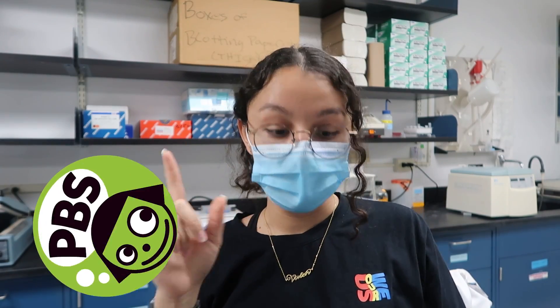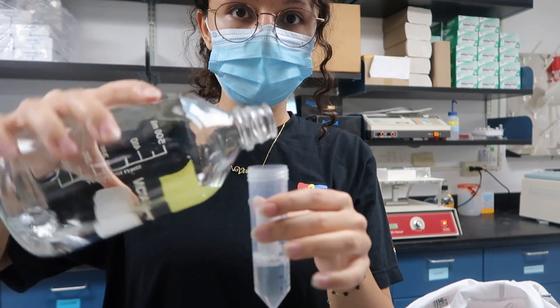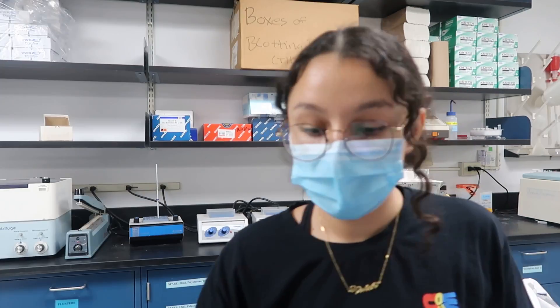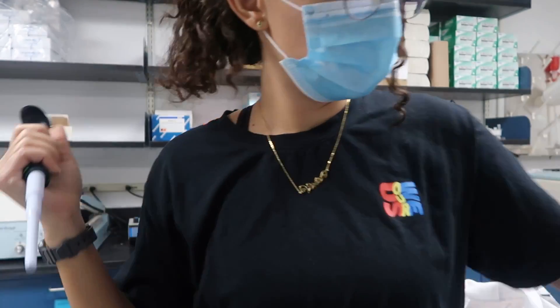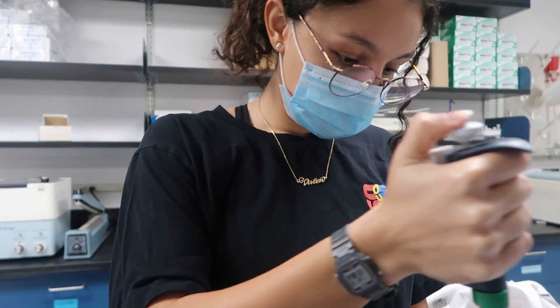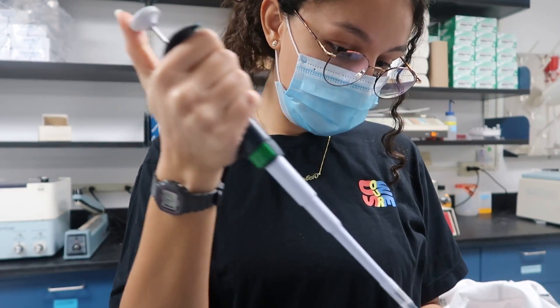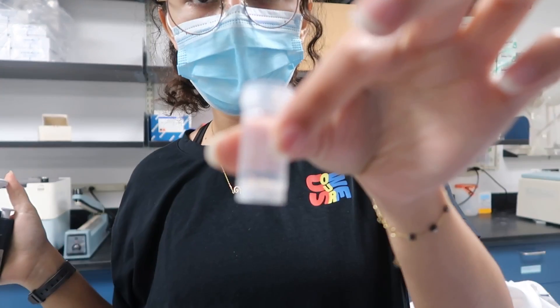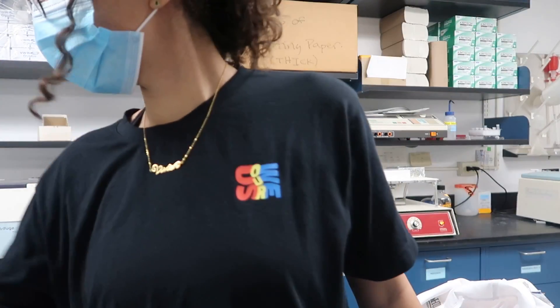So now I'm going to put 2,000 of PBS. I'm going to use a new pipette tip because I'm not trying to contaminate my PBS. And now 1,000... 2,000. Yay! Now I have 5% normal donkey serum. I'm going to throw away this old one — yeet.